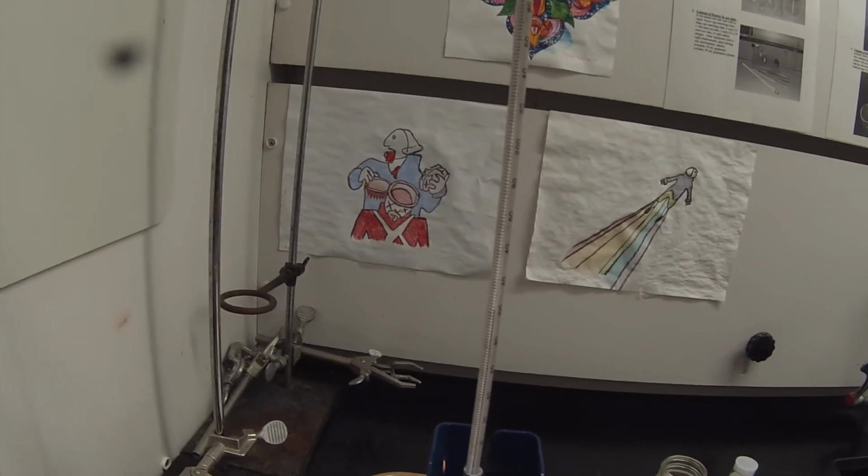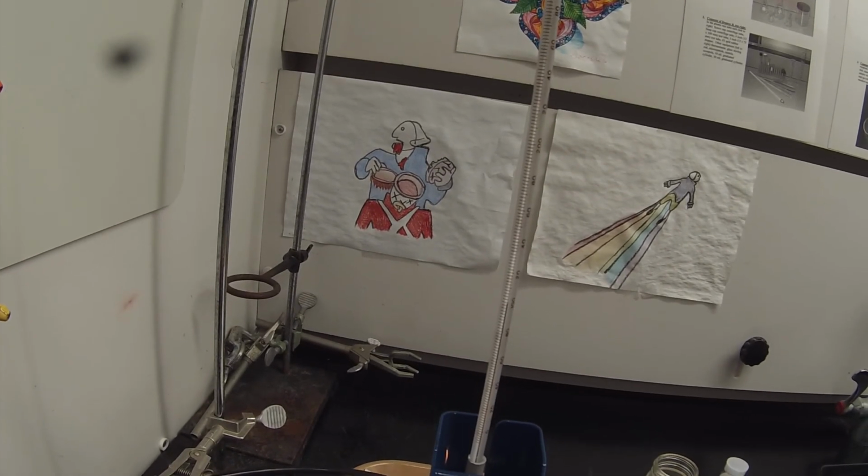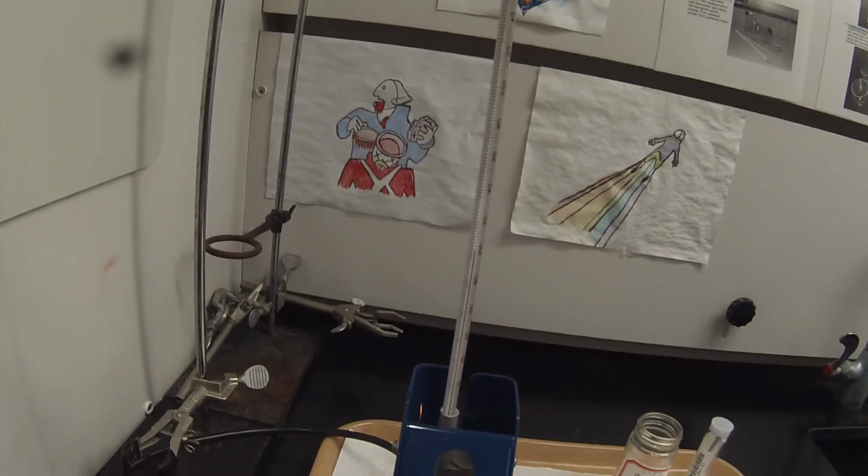Down to 100. I want to let that drop to about 60 before I put the sample back in.